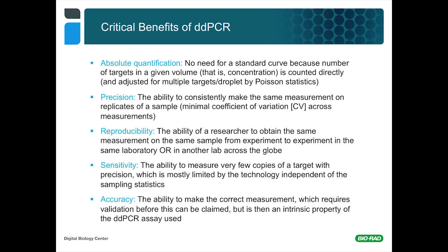You have greater precision; as you'll see, replicates are very similar one to the next in the measurements they make on a given sample. And an important feature is also reproducibility. That's both experiment to experiment, day to day within a single lab, or also for labs scattered across the globe, that different researchers can get the same result reproducibly.